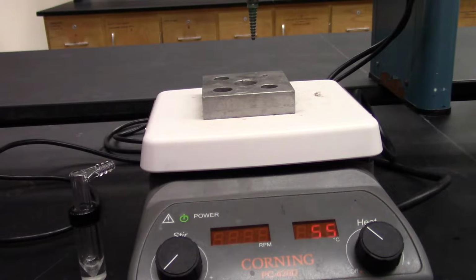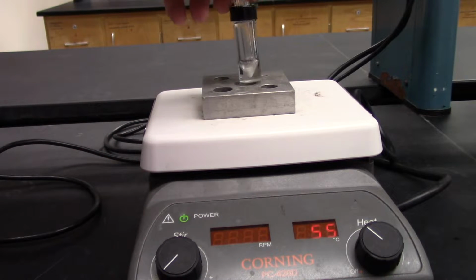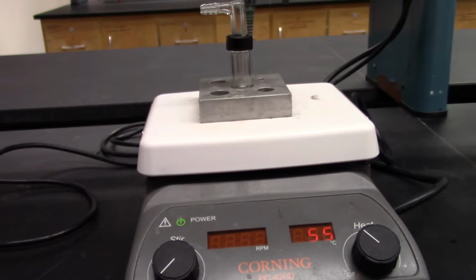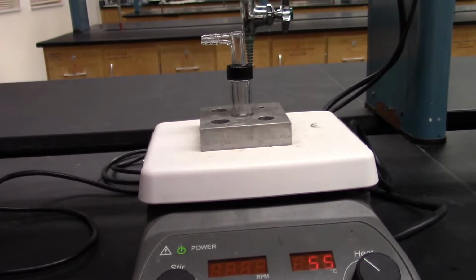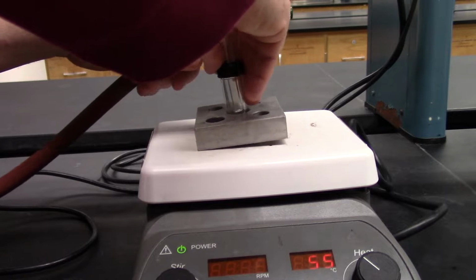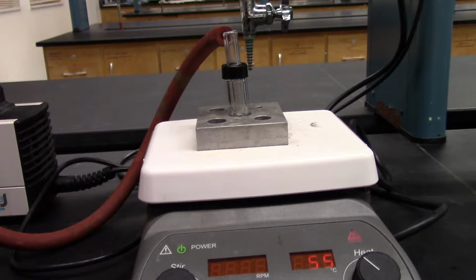We are going to take our sublimer and put it in the heating block, just like that. See how that looks? I'll give it a little more height here. There we go. And now I'm going to plug in the vacuum, just like that. Maybe move it a little closer. There we go. Turn it on. It's going to get real loud, so bear with it.